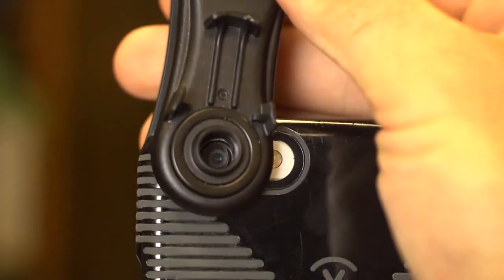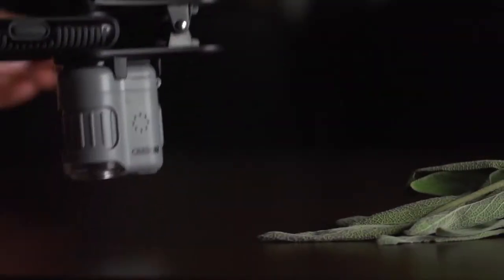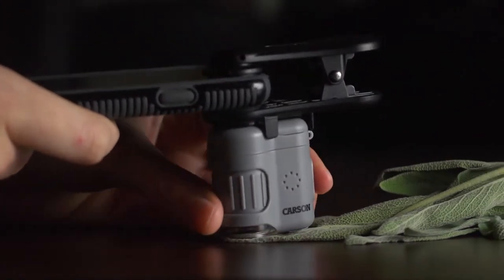Just place the smartphone clip directly over the lens of your phone. The microscope features a magnetic eyepiece that instantly attaches to the adapter and can be removed at any time.